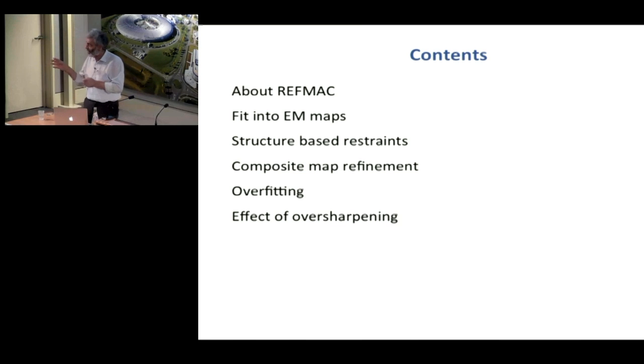And I think that with CCP-EM, these things will become easier. Hopefully, in one year's time, you will have to push a few buttons instead of running scripts. But at the moment, if you want to use different tools and different options in the programs, you will have to use at least some bash scripts.